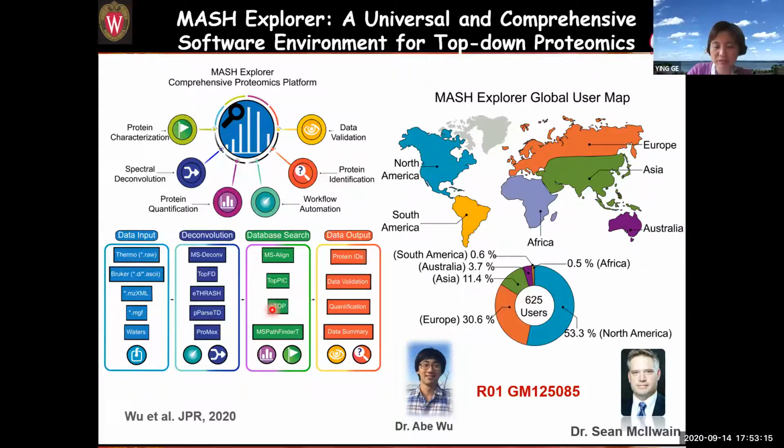So we recently published a paper in JASMS, in honor of the John Yates Distinguished Scientist Award. We have shown a strategy called ensemble machine learning that can couple all these different algorithms together and have a uniform output to address the question you have.